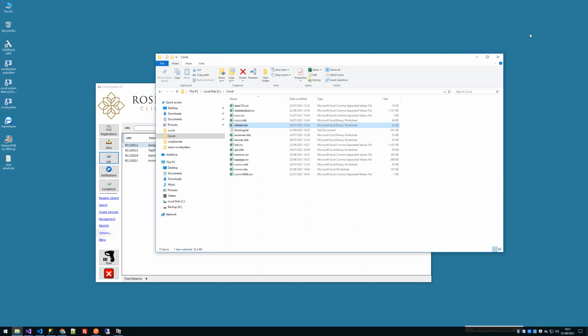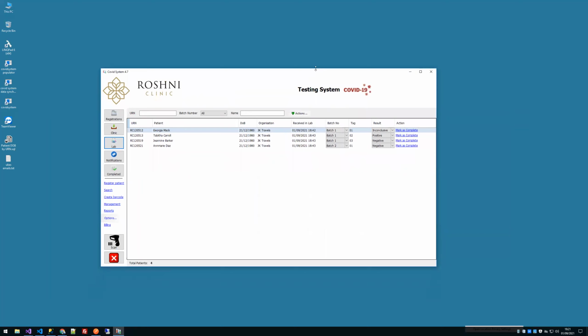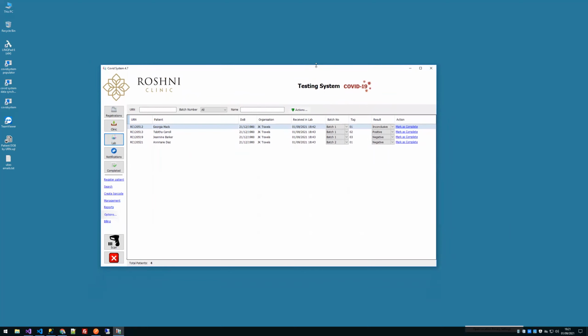Okay, so I'll have to digest all this. Yeah, sorry, a bit too much. Might be too much information, but I'm glad you're throwing it at me. Is there any dummy thing that I could log into, play around, click around?